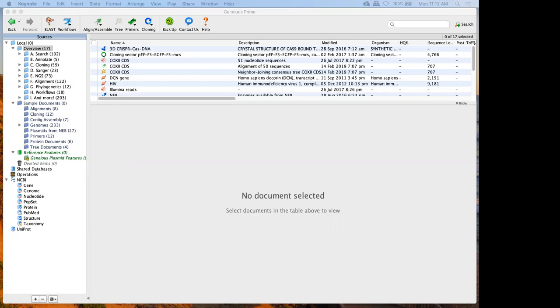But we're going to start out with just where things are in Geneious, how it works. I'll give you an overview of things. And then we'll start talking through some of those tools like annotation and NGS and primers and that. But send through questions at any point. So with that, this is Geneious. Like I said, it does run on Windows, Mac, and Linux. I'm on a Mac at the moment, but it is going to look pretty much the same if you're working on Windows or Linux. There's a few minor cosmetic differences. I'll point those out if we run into them.